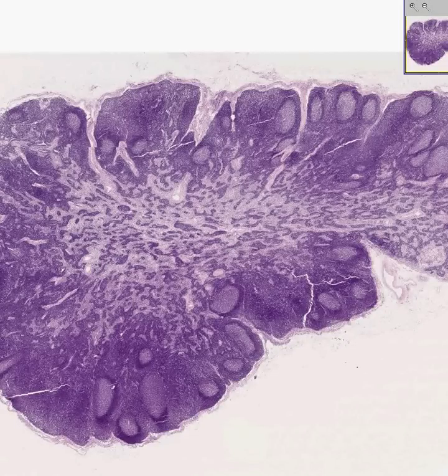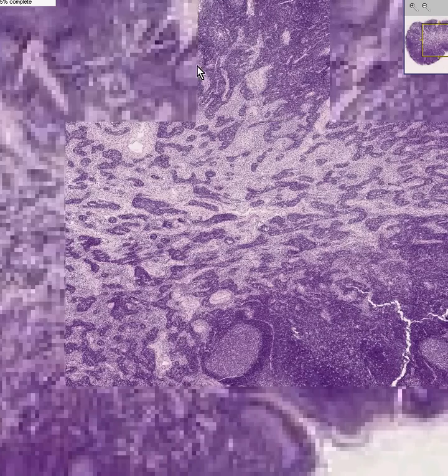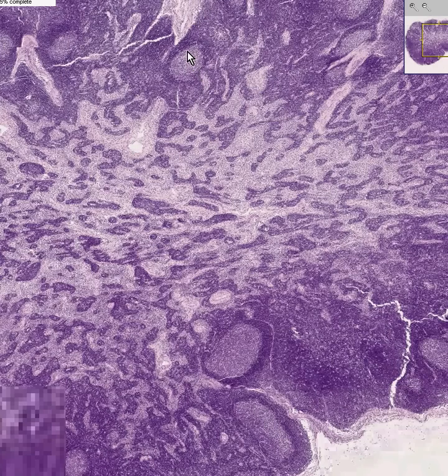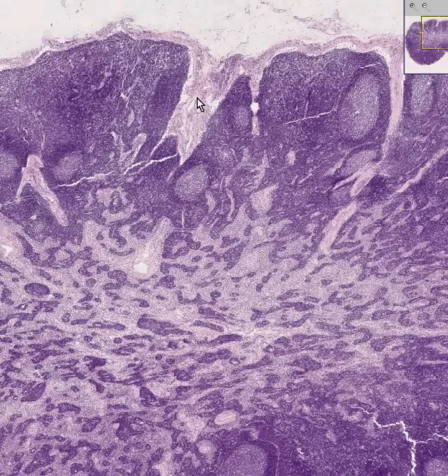Here is some more lymphoid tissue. In fact, it looks like it's differentiated enough to be an actual lymphoid organ. And in fact, it is the most classical picture you will ever see for a regular old lymph node. This is a classic appearance for a lymph node — any lymph node — and I'm going to tell you why.